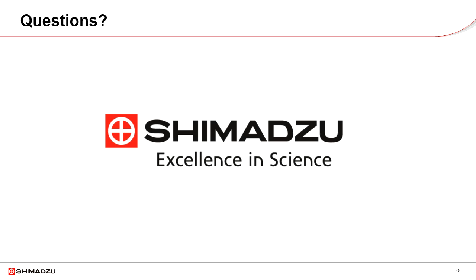That's a great question. You know, the challenges are always doing things better and faster. So obviously, SFC offers a much faster way of doing resolution or isolation separations in a high-speed area.